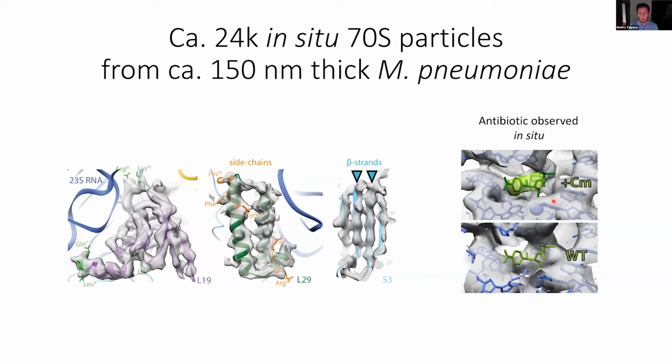But then moving on to smaller proteins, which are less abundant in cells, was quite, well, not straightforward, but definitely possible, as we see now. Whereas in situ, ribosomes are very, very special in their properties, and all of these properties are very favorable towards in situ sample data collection.